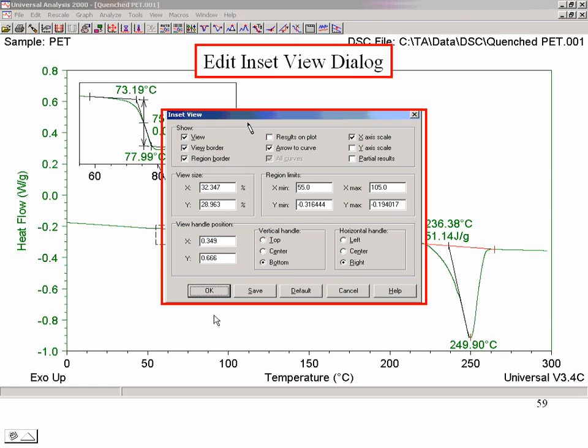If you go there, you get various options that you can use to customize the plot. That controls whether there's an x-axis on it or a y-axis on it, stuff like that. You can explicitly define the regions that are plotted, things like that.